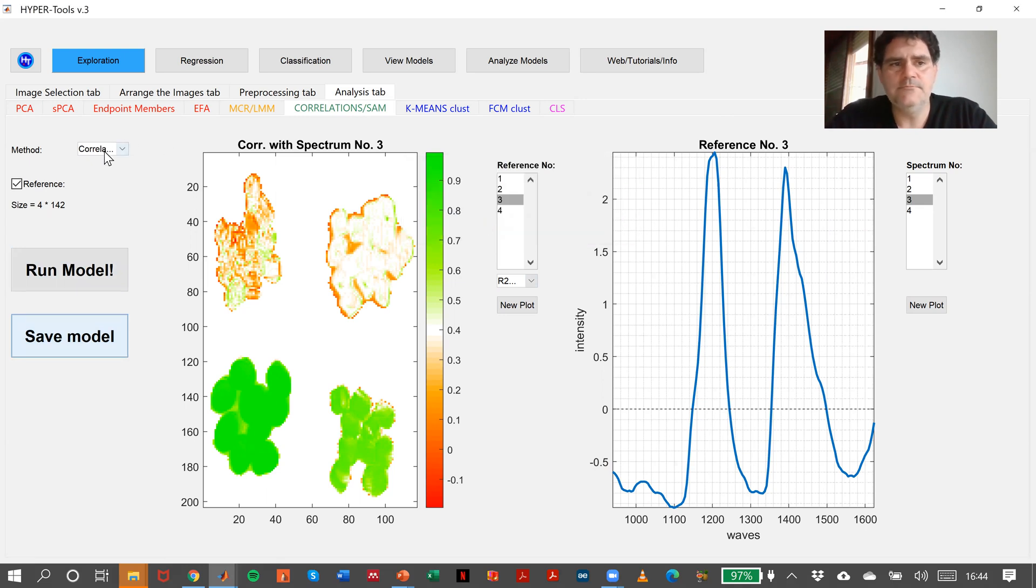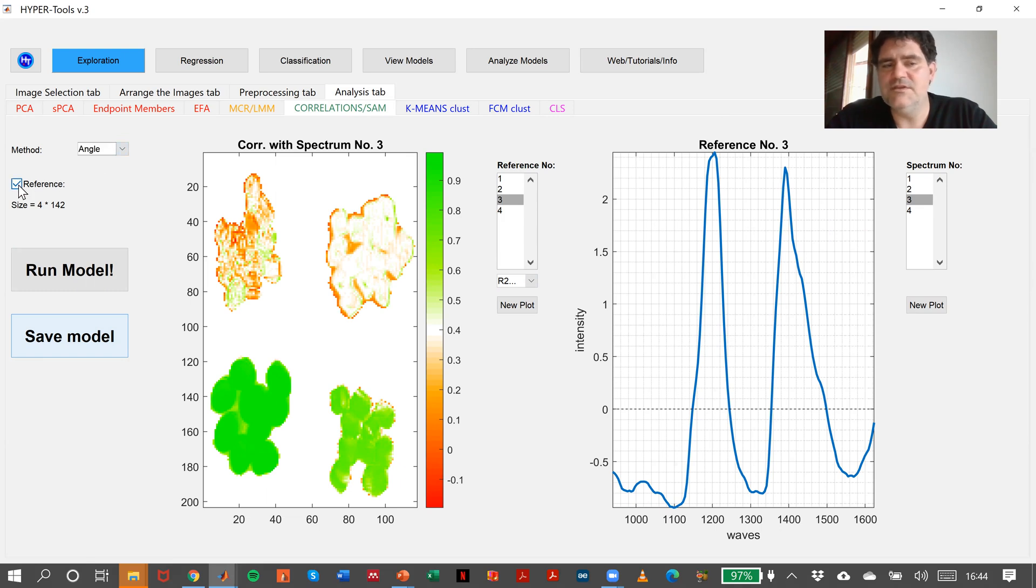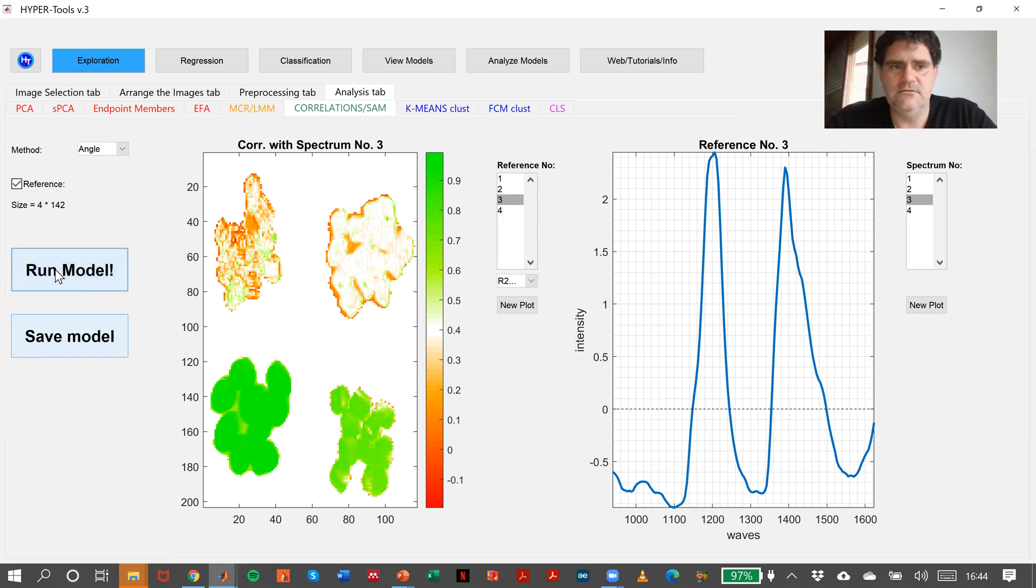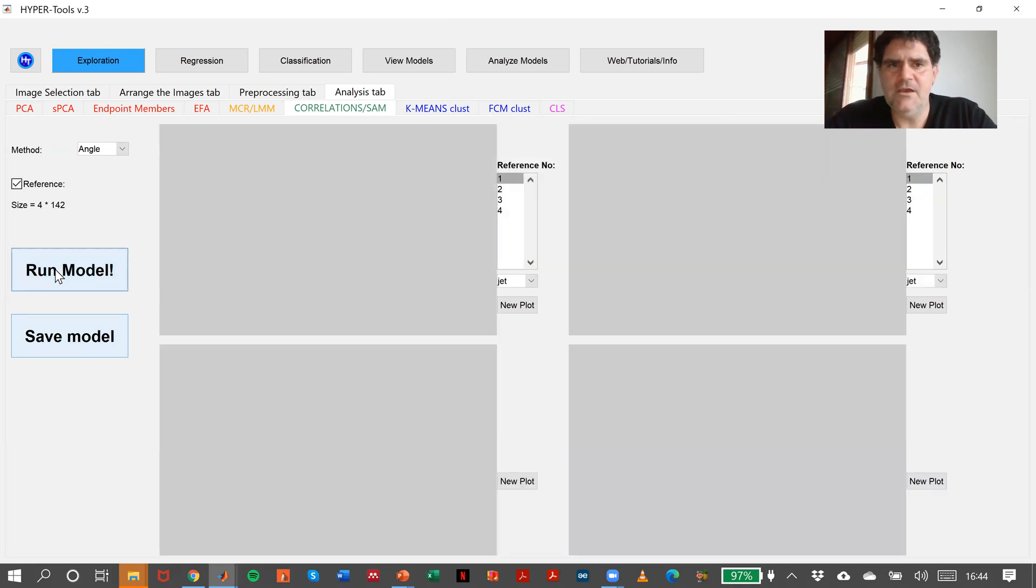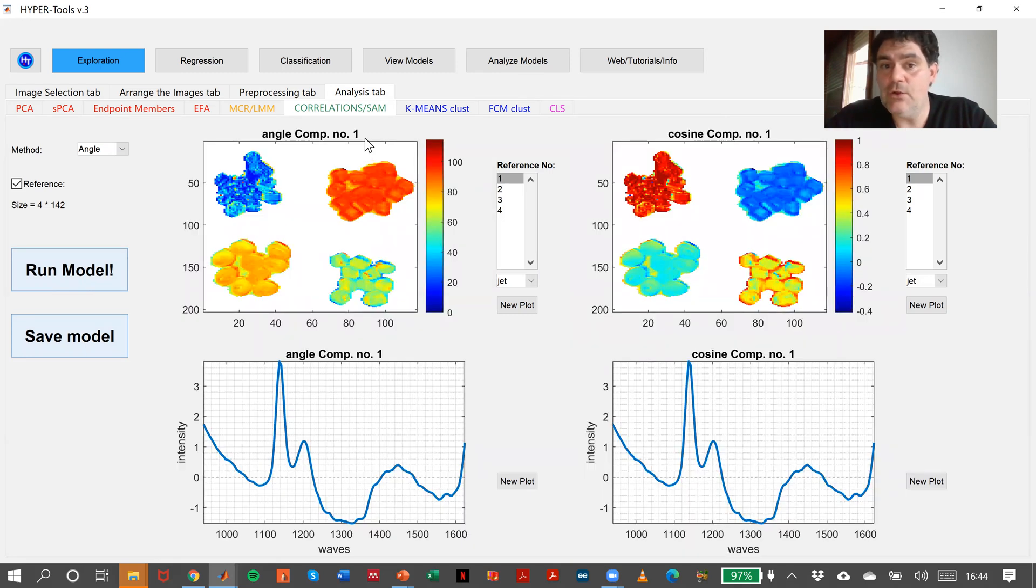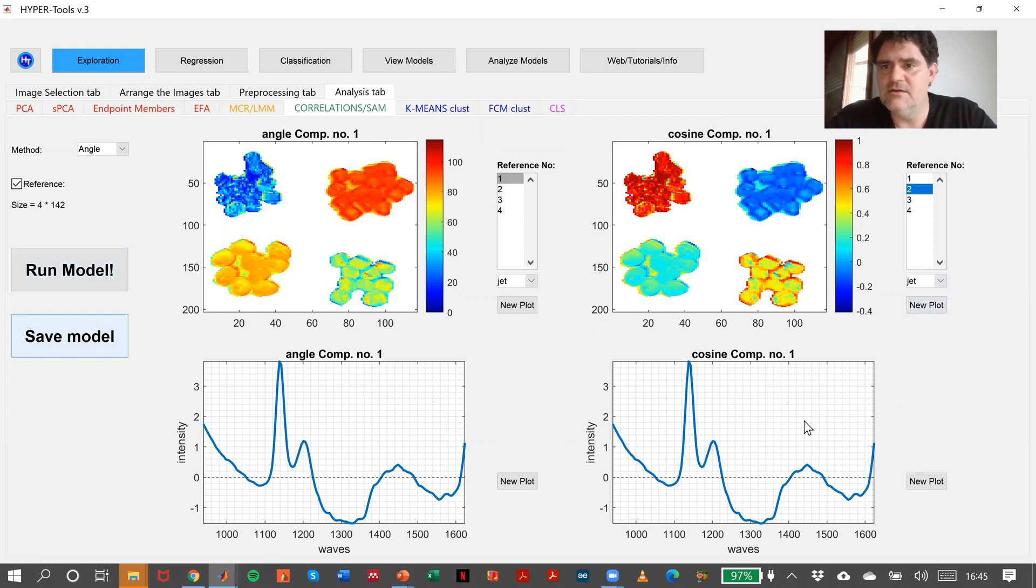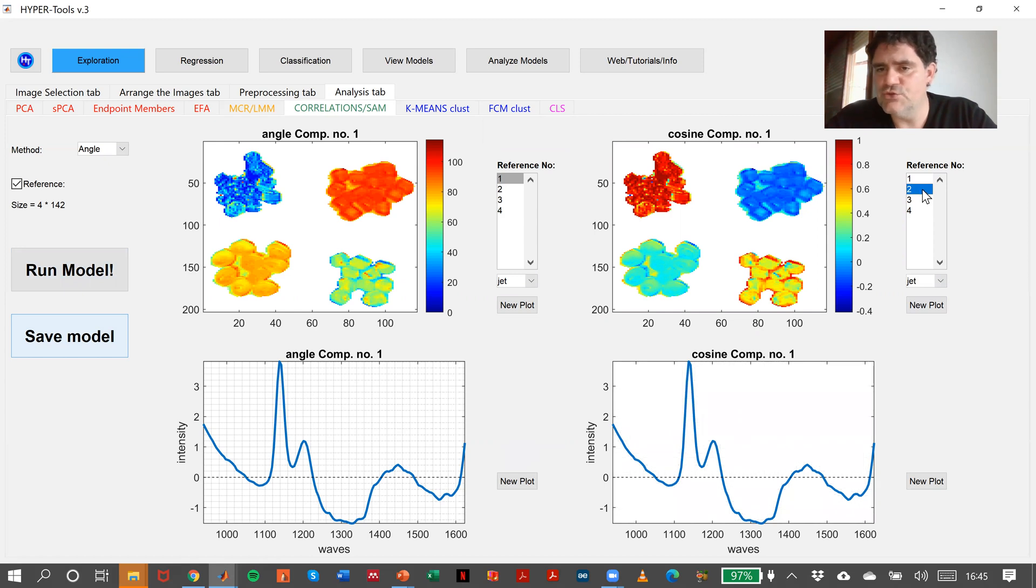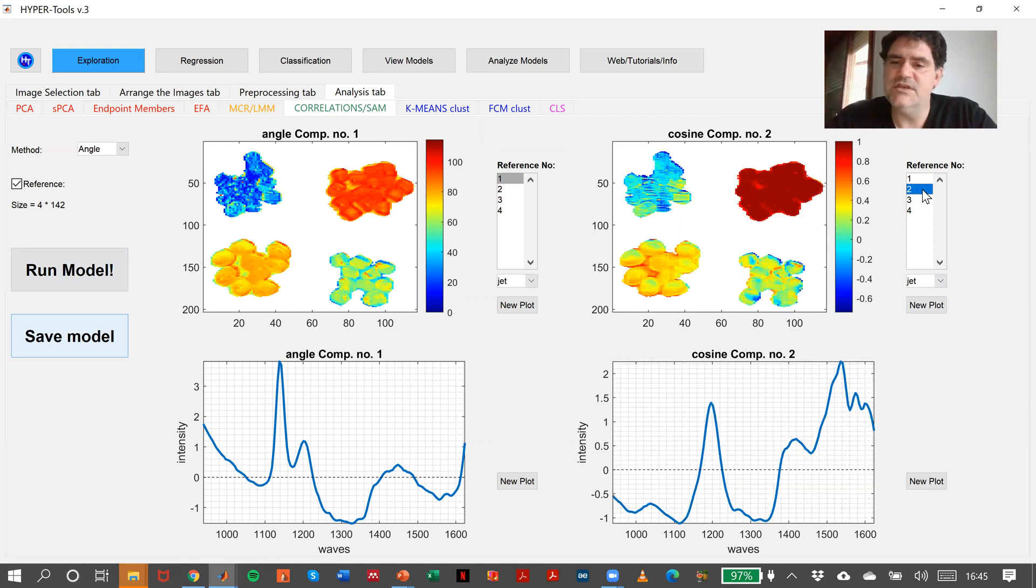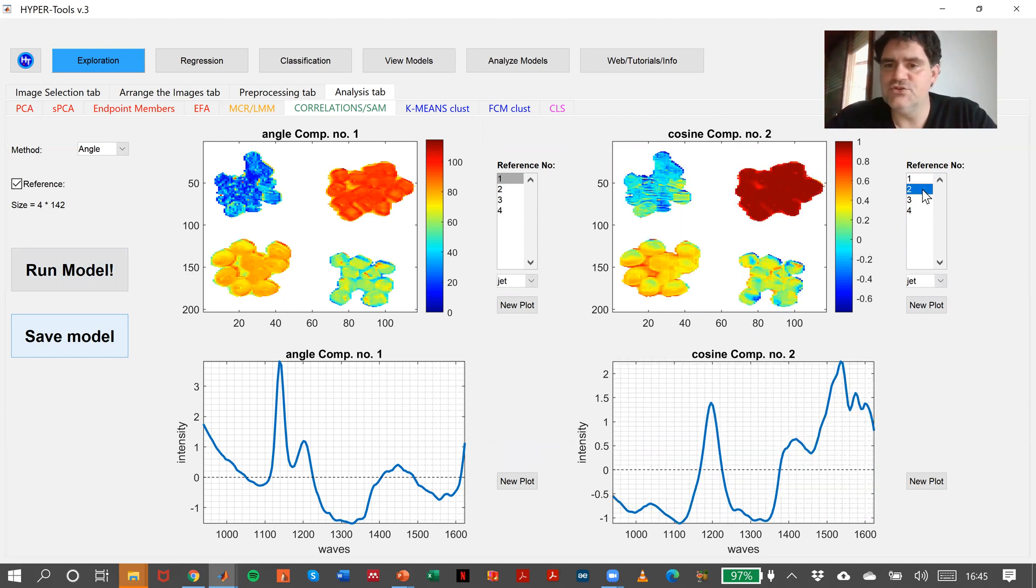And then, I can just click in angle, and with the same references, if I run the model, here we are. Here I have the angle, and here we have the cosine of the angle that is the inverse. This is the cosine for component number one that is in here, this will be for component number two, and it will change to component number two in here, or one and two.